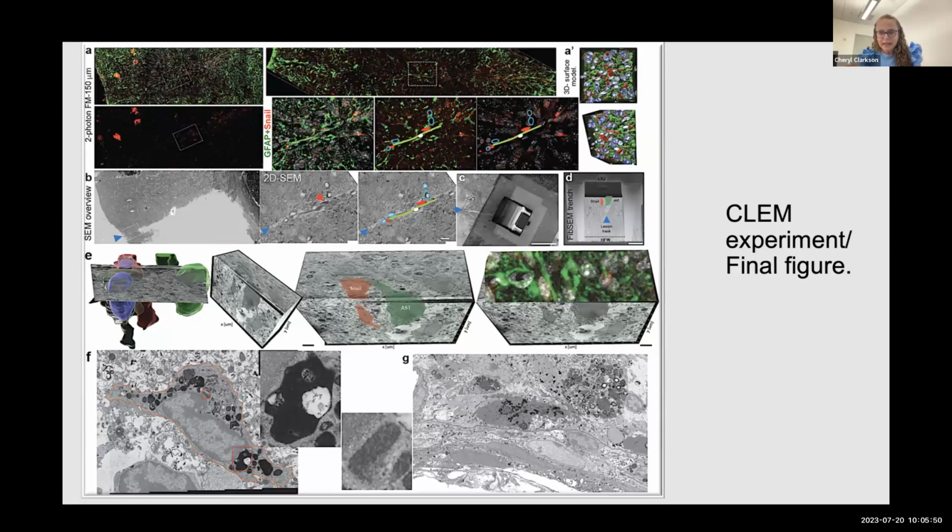So if you are careful enough, even running immunofluorescence with antigen retrieval, that in theory puts a lot of stress on your tissue, on your membranes, you can get nice ultrastructure. All this, even after a lesion, because when you are lesioning a tissue, you are creating a very neuroinflammatory environment that is making your tissue more susceptible to damage.